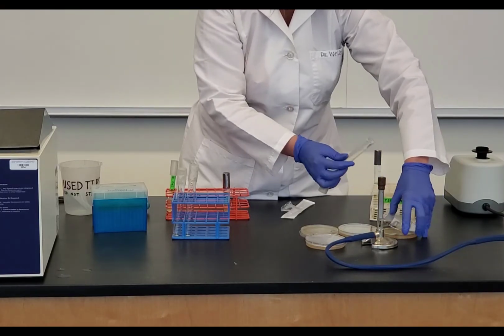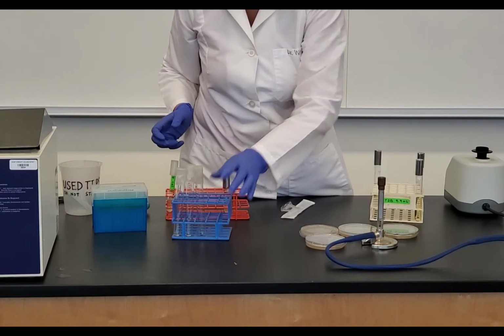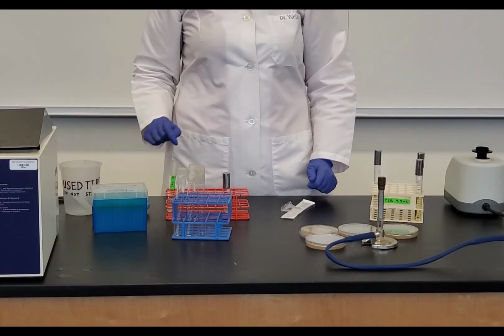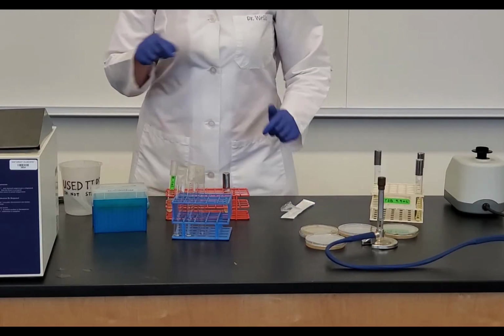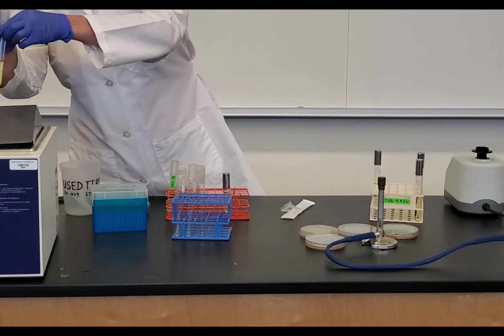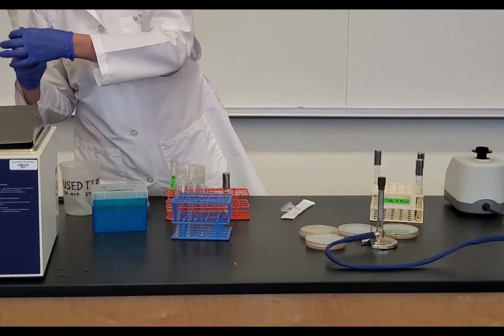Trying to get it all out. And then cap this, put it aside. I have one plate left, and that is my 10 to the negative 6. So I'm going to repeat this again. I'm going to take out my last melted agar deep, and I'm going to dry off the extra water.